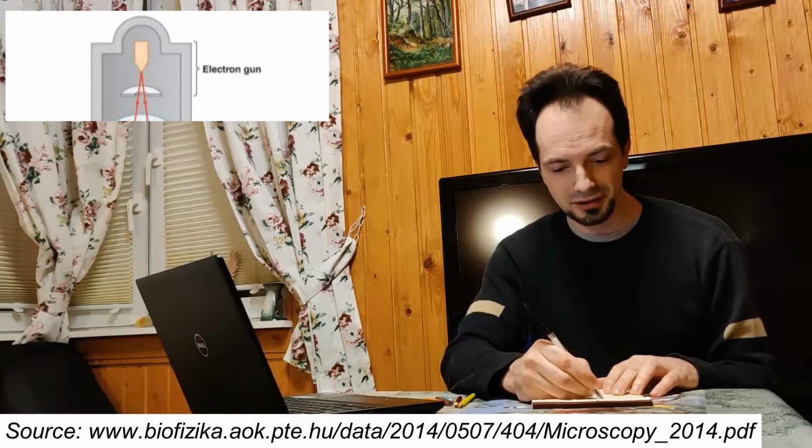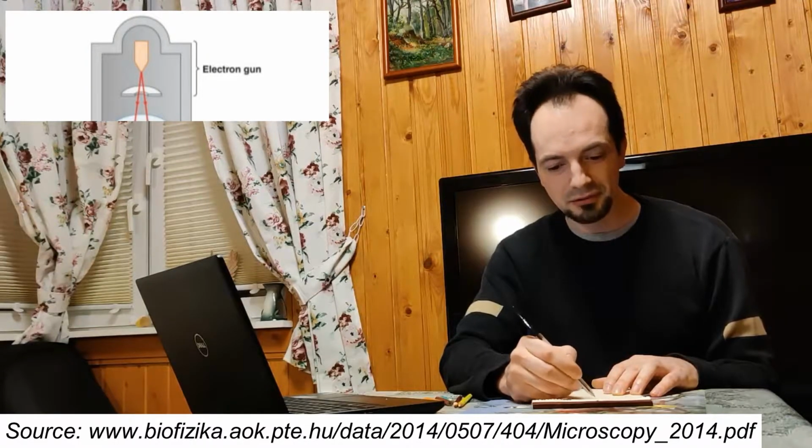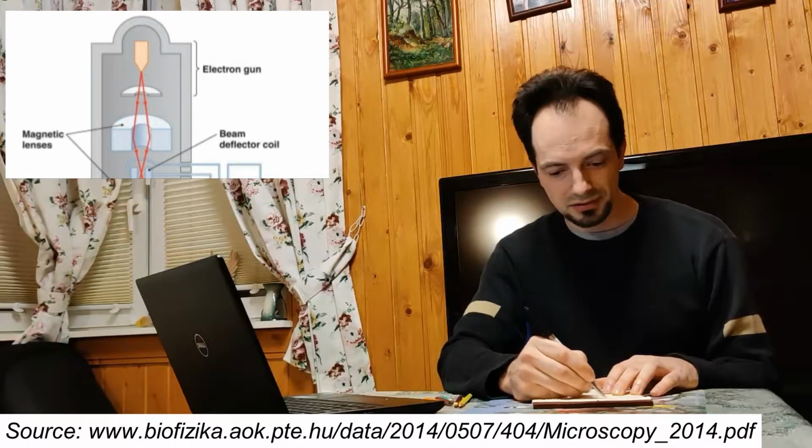I will now try to show you the basic scheme of the apparatus itself, the basic components of the microscope itself. So let's draw them here. To start an electron beam, we need an electron gun. The main element of the electron gun is a cathode. We will talk about cathodes on the next slide, but as for now, the cathode is the start. Then we need some kind of preliminary accelerating system for the beam. That's where the beam starts. Then we need some kind of focusing system and apertures in order to form the beam.